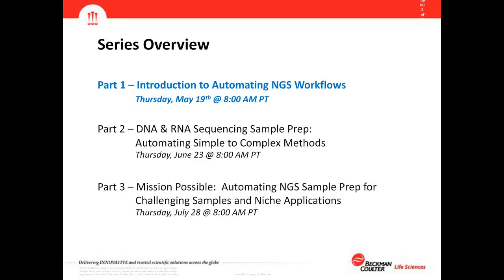As Judy mentioned, this is part one of a three-part webinar series, and so today we'll be talking about introducing customers to automating NGS workflows. We'll continue in June with the second part of DNA and RNA sequencing sample prep, and then go into a little more detail on specific methods ranging from simple to complex. The third part of the series is entitled Mission Possible, Automating NGS Sample Prep for Challenging Samples and Niche Applications. So we'll be discussing some of the applications that are becoming available for niche markets and how we address challenges of manual processing for those chemistries.